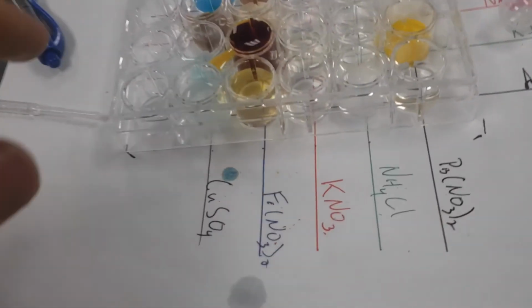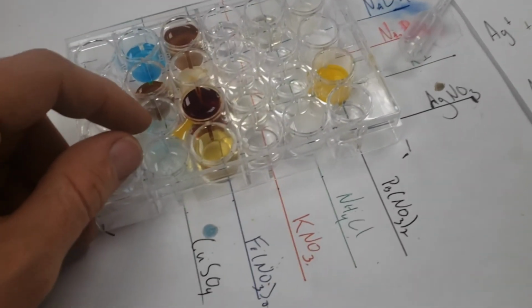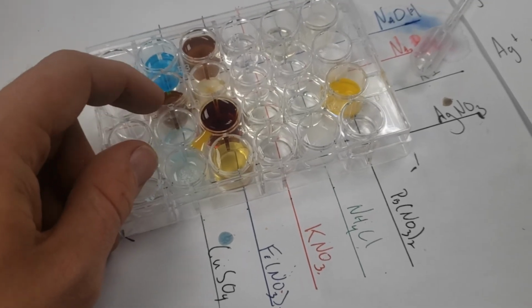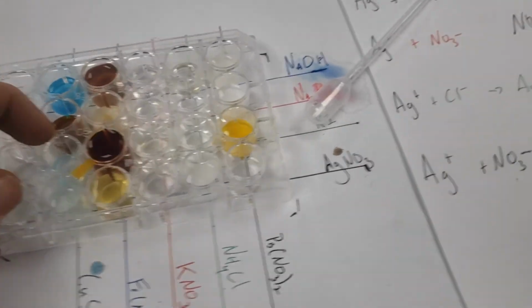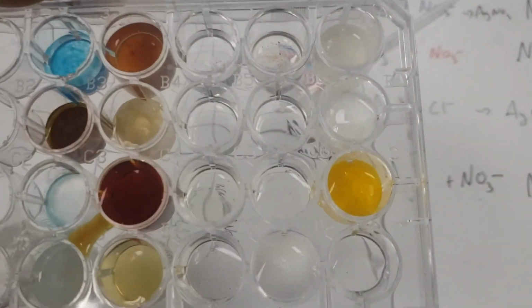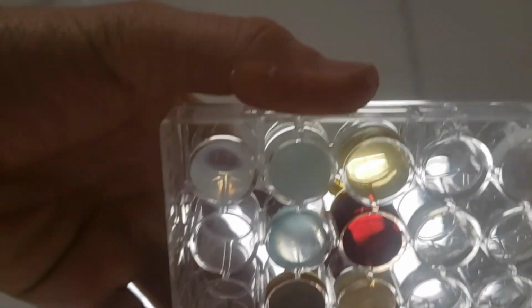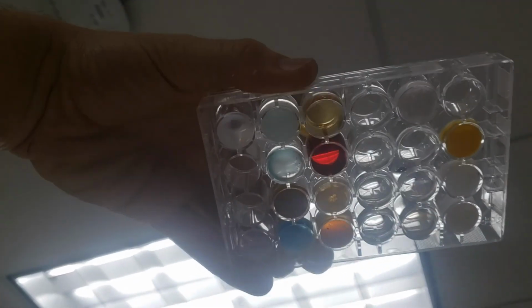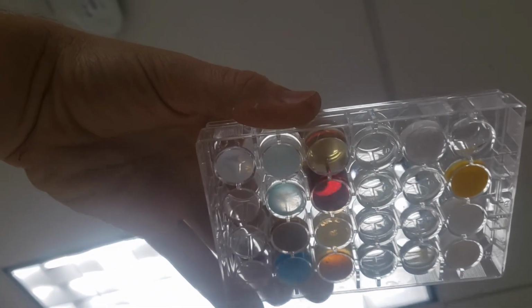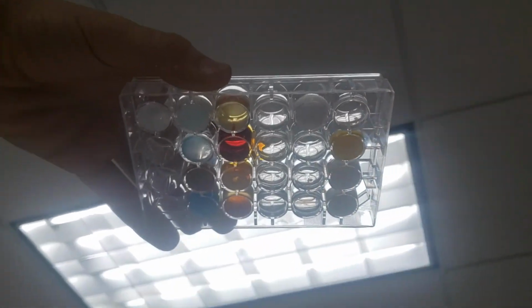Now, as I said, I made one goof. I'm 99% sure this is the iodide and this is the phosphate here. In reality, it doesn't matter. Both are going to make it precipitate with copper, so, oops. But that's where we are. And sure, when we're done with the section of what we centrifuged, if I take this thing and I bring it up, oh, look at that. I can look through them, and the ones I can see through didn't make precipitates, right? And the one I can see through that's colorful, the one with my finger in it right now, that's not a precipitate. Ooh, little contamination there. And so there we are. We actually have made a basic analytical chemistry.